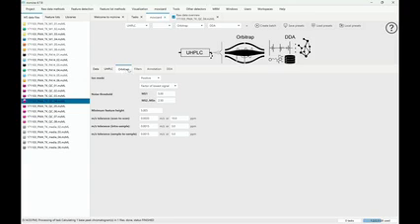With Orbitrap settings, you can just leave them at the default. There's the positive mode data. If your data sets only have one polarity, and this file is only positive, we could keep it to no filter. If it is polarity switching, positive and negative, then please select one of these filters here, and then you have to do the processing once for positive and once for negative, and in the end, of course, you can try to merge these results. But we have to process them separately.